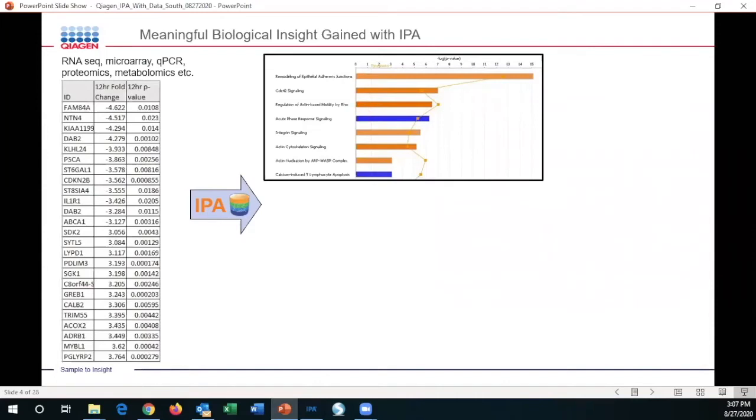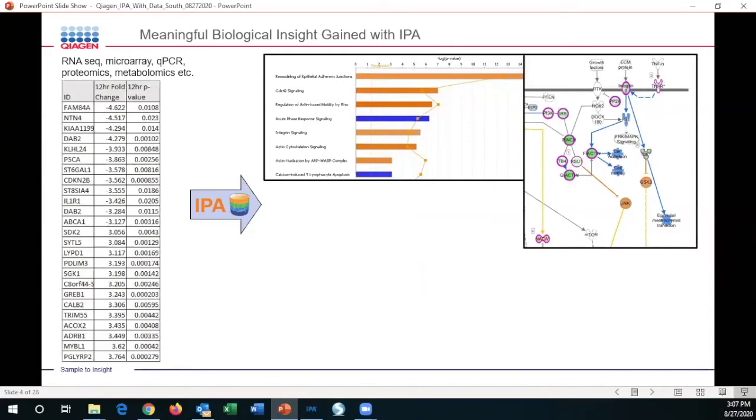But beyond this, we have the ability to interrogate pathways at a much finer level of detail. In fact, we can choose any pathway that we identify from the analysis and open it up as a network. Here, the molecules outlined in purple are where in the pathway I see expression changes in my data set. Again, it could be at the gene level, the protein level, what have you. What we're going to do then is overlay green and red colors. The greens are observed decreases. I think there are a couple of reds here. Those are observed increases in our data set.